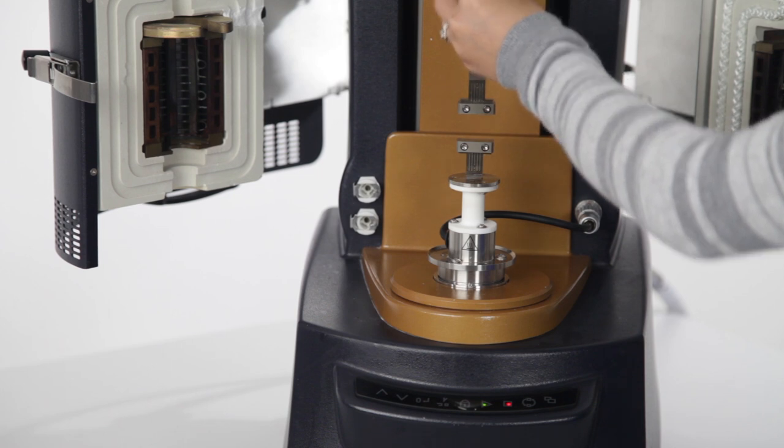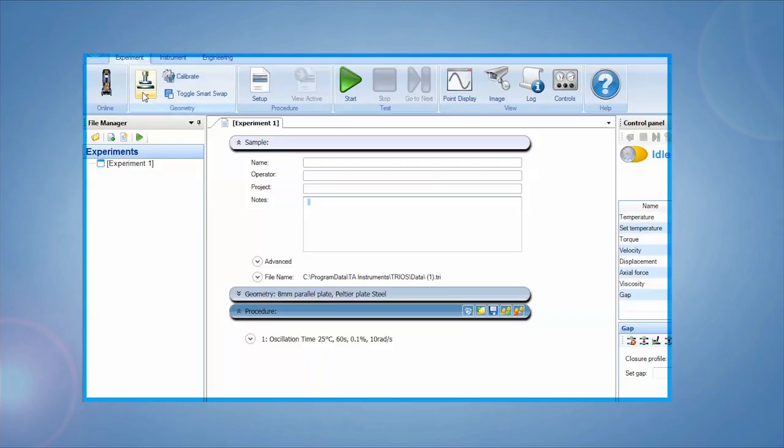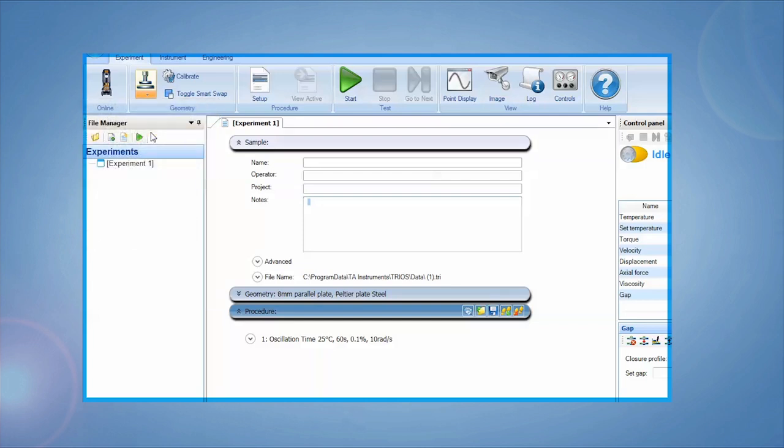After mounting the fixtures to the DHR, choose the linear tension geometry from the drop-down menu in the TRIOS ribbon and zero the gap.